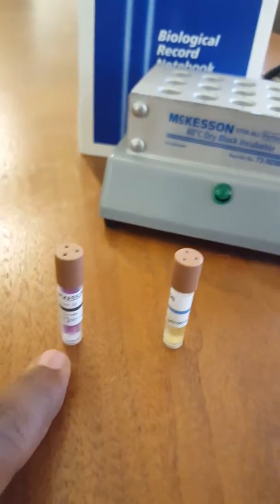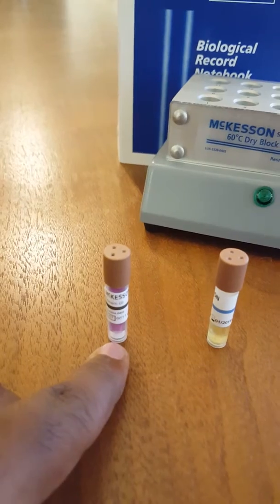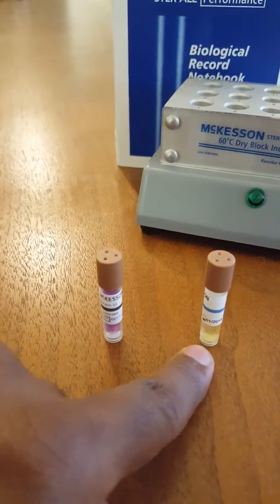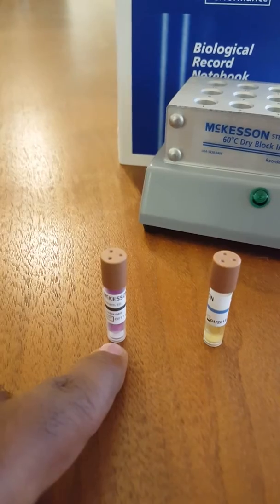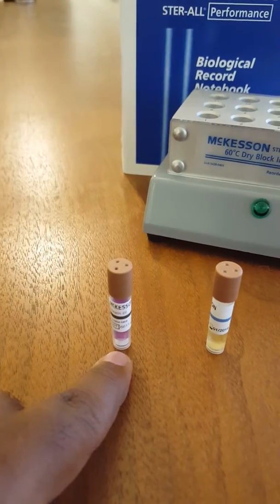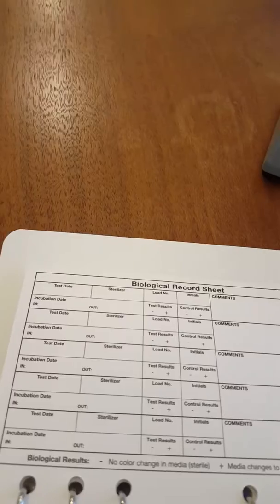So what we're confirming next is that the autoclave worked properly. The way that we know that it worked properly is it did not change colors. Had it changed to this color, that would have shown that there was a presence of spores within the autoclave. But being that it stayed the same color, purple, that allows us to know that our autoclave worked properly as far as killing the spores prior to being placed inside of the incubator to try to grow spores.